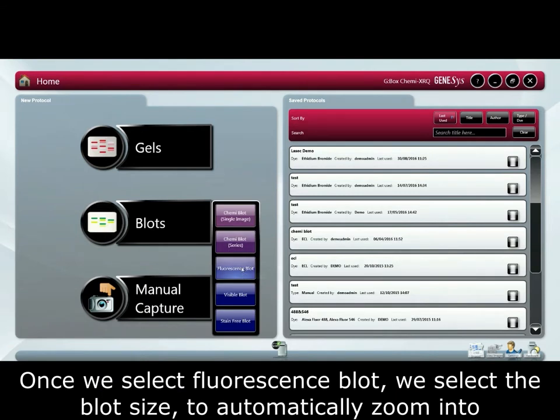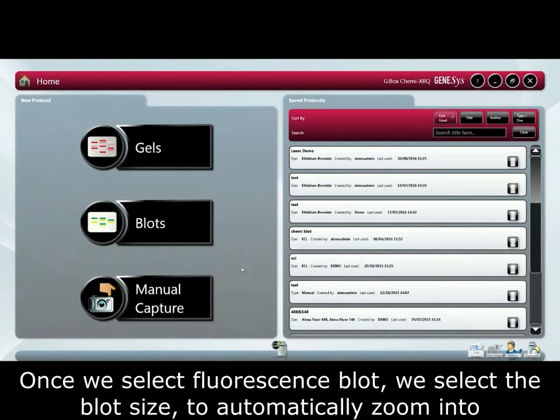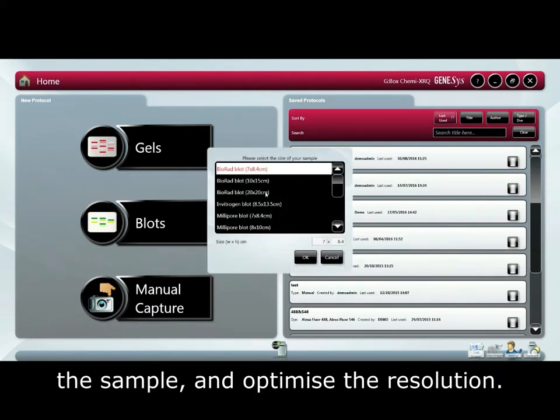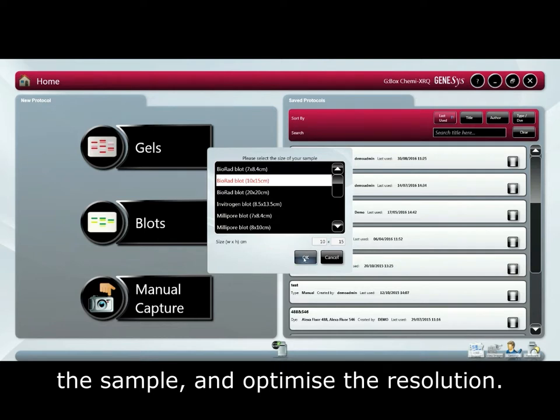Once we select a fluorescence blot, we select the blot size to automatically zoom in on the sample and optimize the resolution.